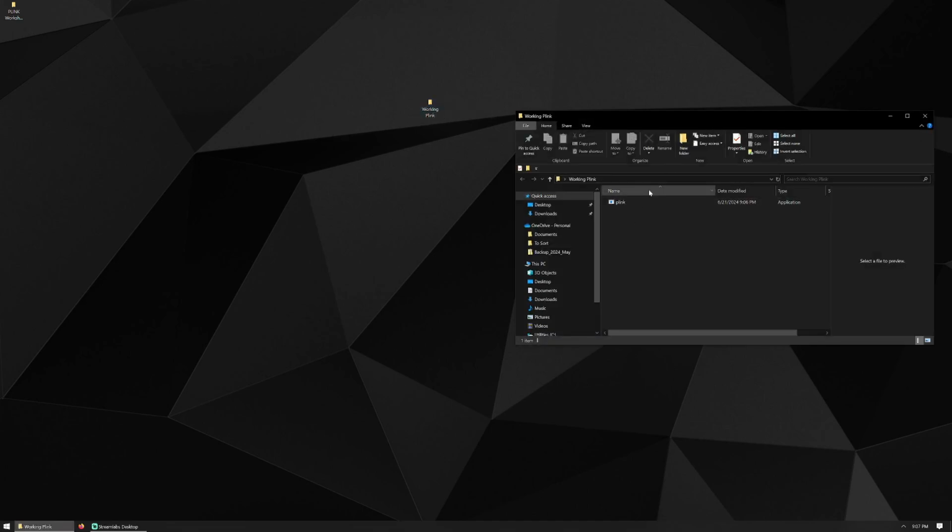Now, odds are if you've ever installed any software at all, you've downloaded an exe, you might have right-clicked or double-clicked on it, and something popped up and it tried to install some files, and then you have your new program running on your PC. Plink does not work like that. If you try to run Plink like that, nothing will happen. That's because Plink needs to be run from the command line. It has a command line interface. Now, if you have used a terminal before and you have a preferred program to do that with, such as MobaXterm or some Cygwin stuff, I personally use the RStudio environment to interact with Plink. There are other options, but we're going to do the most simple built-in one for Windows users just to get started with Plink.